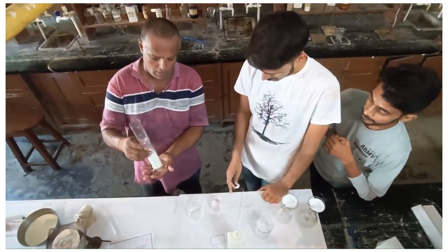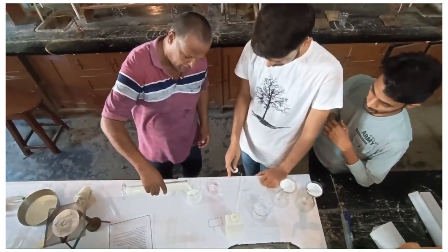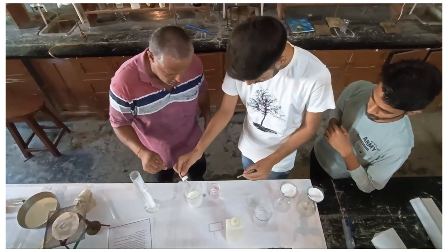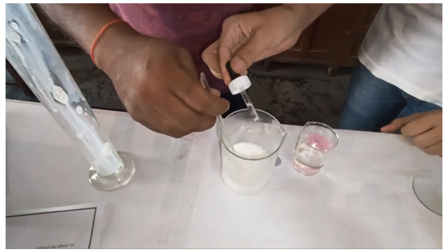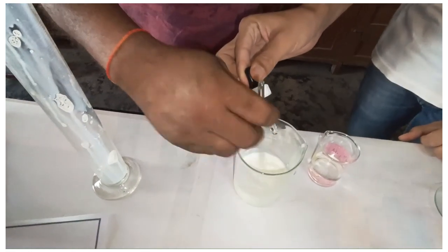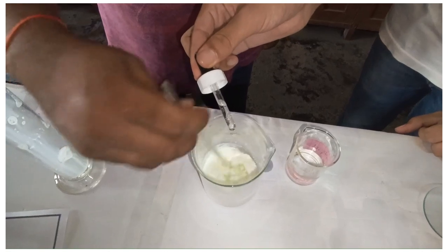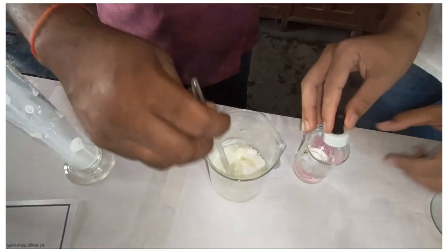The 100 ml of measured milk is transferred into a conical beaker. In this way, we add acetic acid drop by drop so that casein may come to the upper surface. And the pH is near about 4.6.